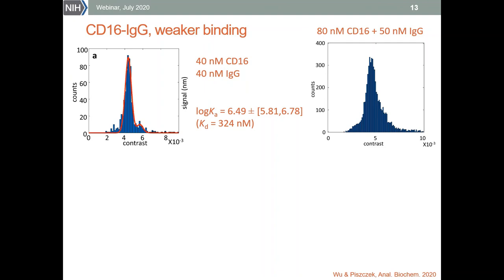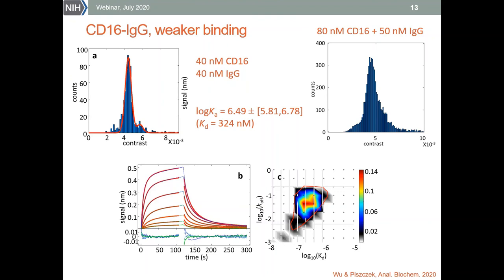We can try to increase protein concentration to populate more complexes, but this results in a very high density of landing events that start to overlap, affecting the quality of the data. The mass distribution obtained for total protein concentration of about 130 nanomolar shows wider peaks and we are losing resolution — indicating the concentration is too high. We can still calculate the binding constant from the first distribution and obtain accurate results validated by BLI, but this binding is definitely approaching the limit of what we can measure without special methods.